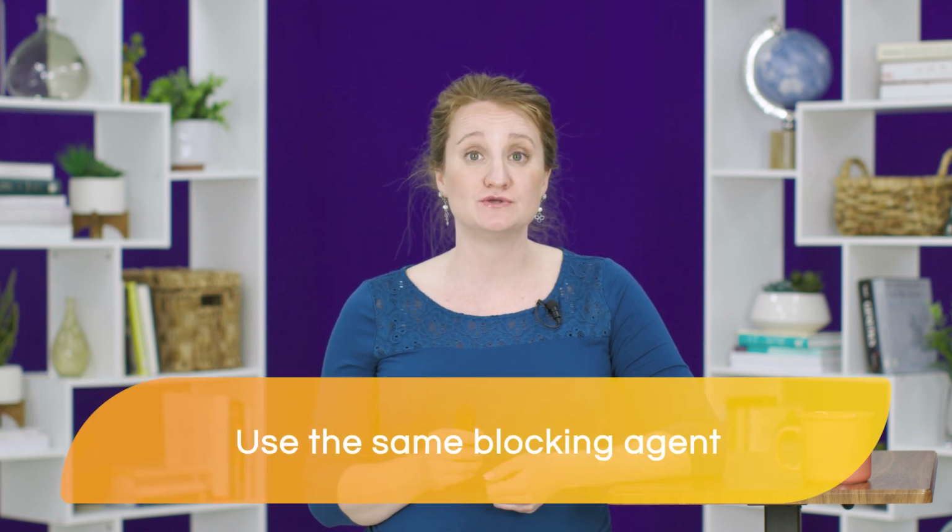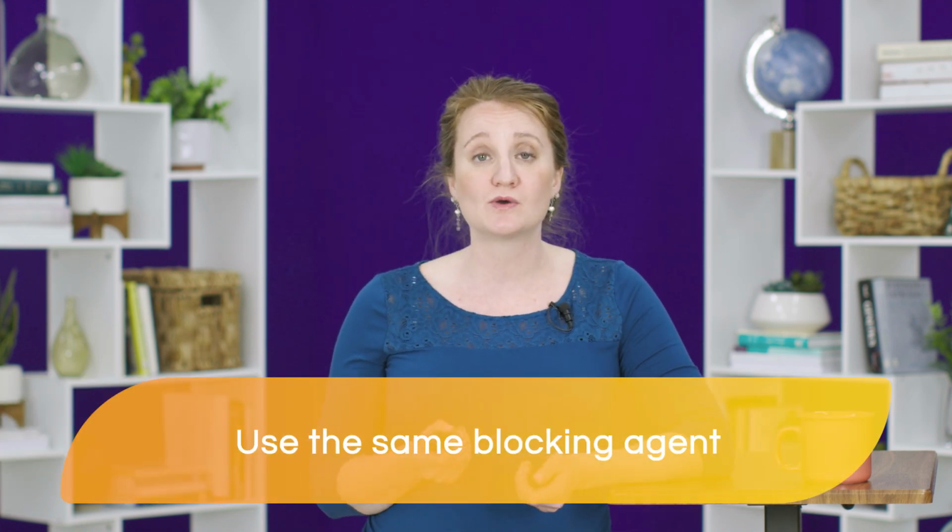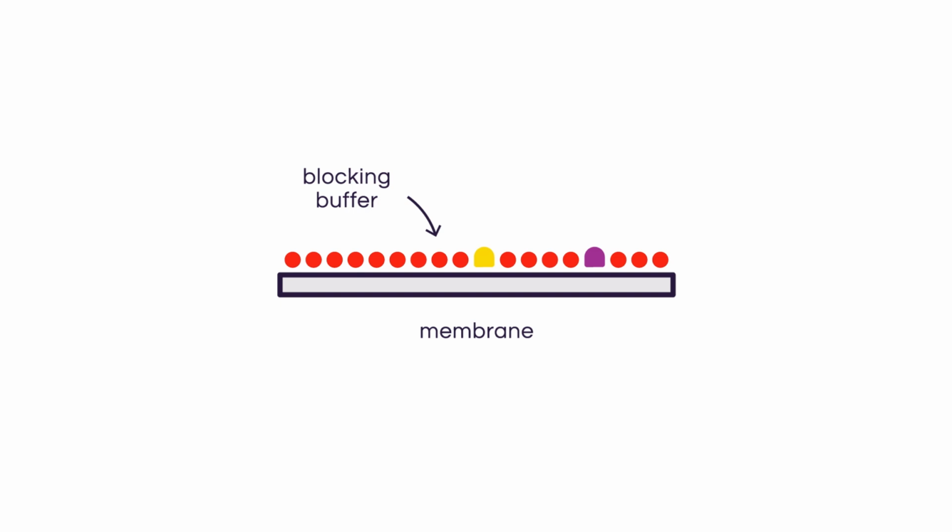When preparing your primary antibody solution, make sure to use the same blocking agent that you used for your blocking step, such as milk or purified protein in either TBS or PBS. During the blocking step, the blocking agent comes into equilibrium between those that are bound and those that are unbound to the membrane. After blocking your membrane, the blocking agent covers every spot on it.